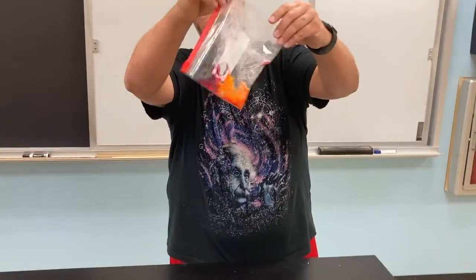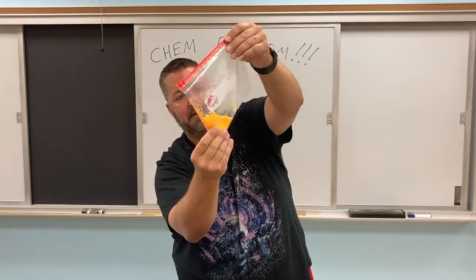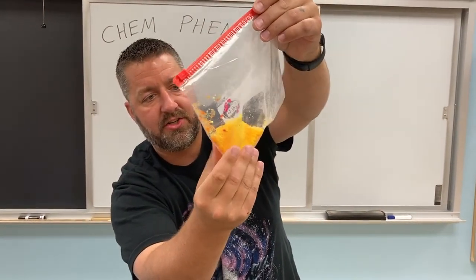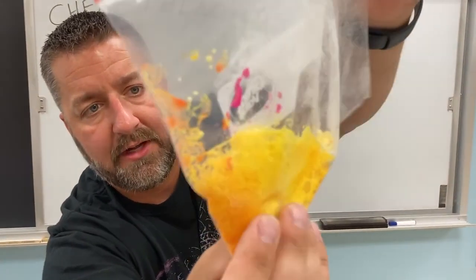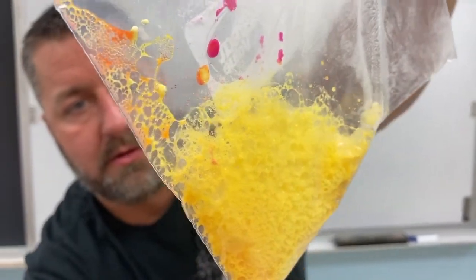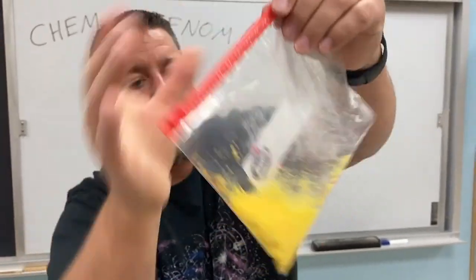Okay, so I'm going to bring them together. Mr. Van Grandel, do you see anything happening? We look like we've got a color change. Sure, it looks like it changed to a yellow. If you zoom in, maybe at home you guys can see, what does it look like is happening inside the bag? Looks like we got some bubbles or something in there. Definitely, we got some gas being produced. Okay, so we had a color change to yellow.